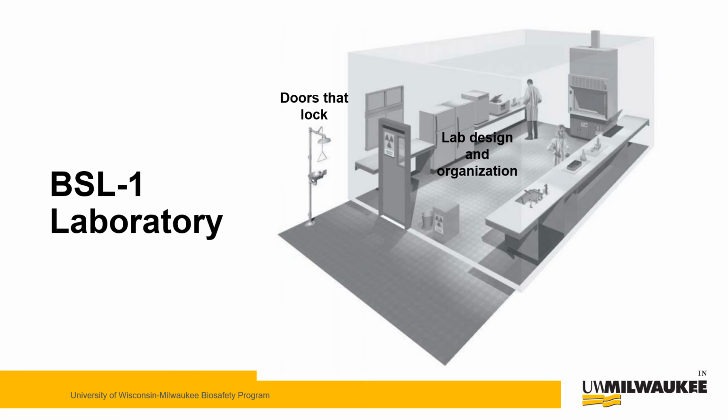Let's investigate a BSL-1 laboratory. Laboratories should have doors for access control. The laboratories must have a sink for hand washing. The laboratory should be designed so that it can be easily cleaned. Carpets and rugs in laboratories are not appropriate. Laboratory furniture must be capable of supporting anticipated loads and uses. Spaces between benches, cabinets, and equipment should be accessible for cleaning.